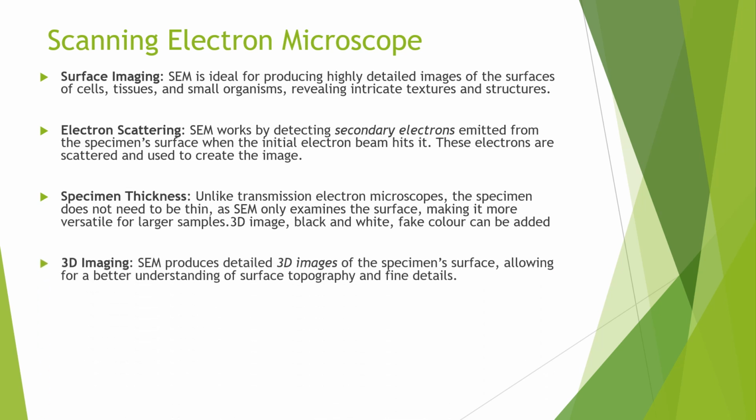Another key feature is that SEMs produce three-dimensional images. The way the electrons interact with the surface of the specimen gives the image depth and texture, which helps to reveal the topography and surface details of the sample in a more dynamic way.